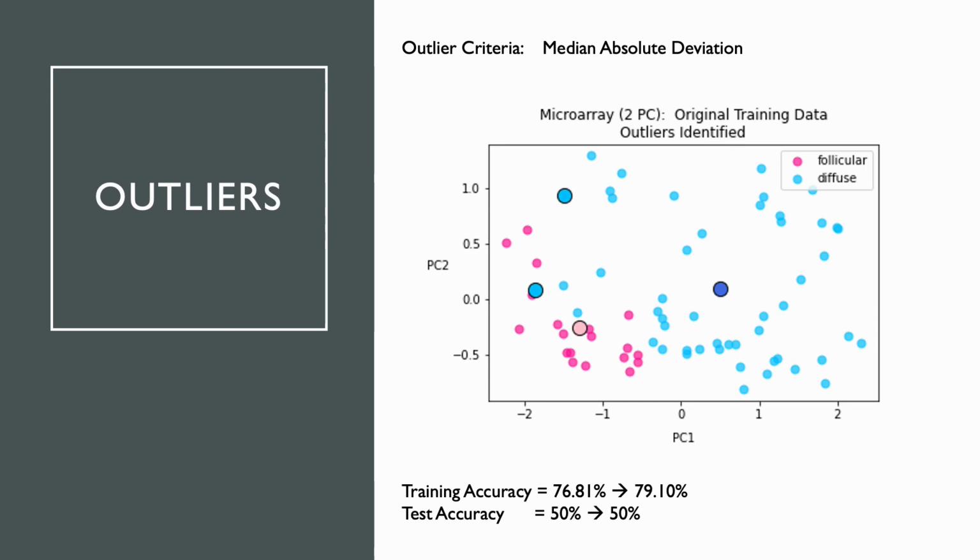Since we know the labels of the original data, we can calculate the centroids, and then we identify the median distance for each sample to their respective centroid. Then for any sample that diverges too far away from the median distance, we classify them as outliers. In my experiment, I was able to identify 2 outliers shown by the big light blue dots.